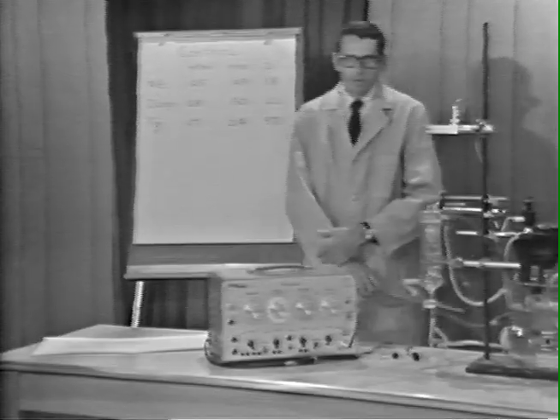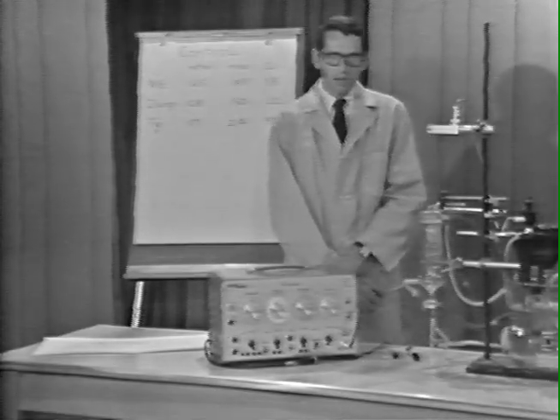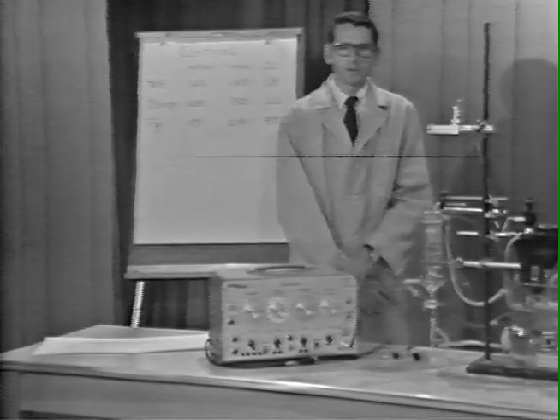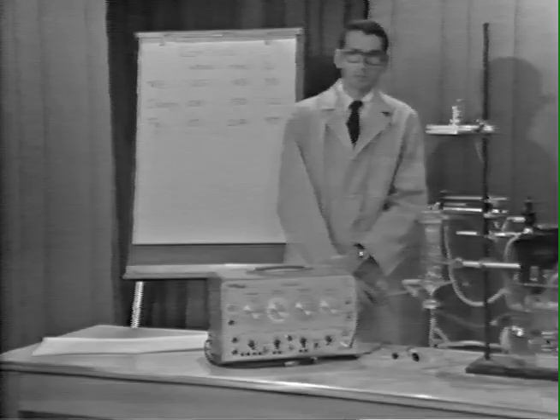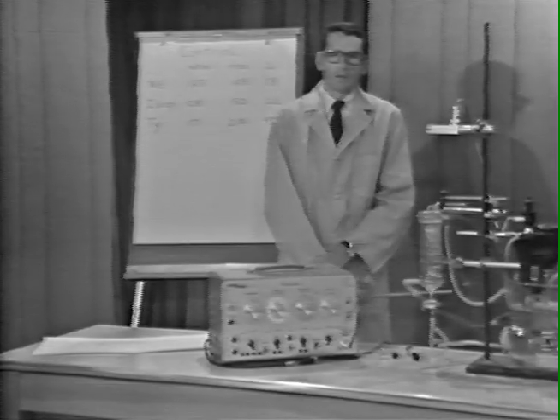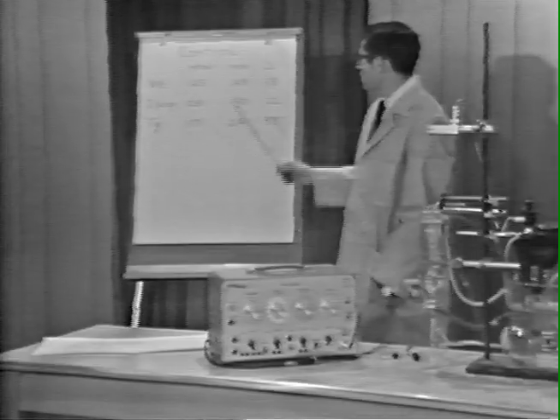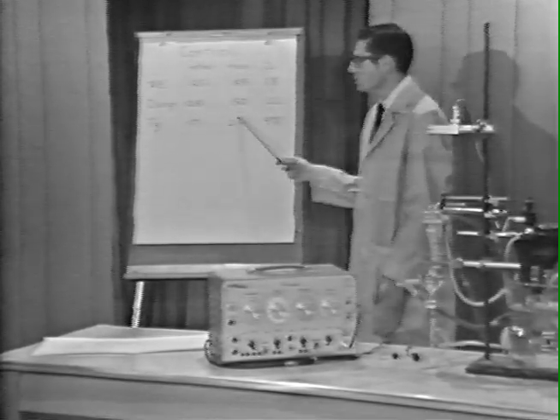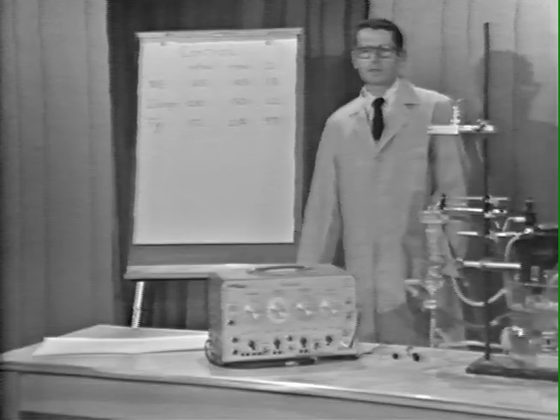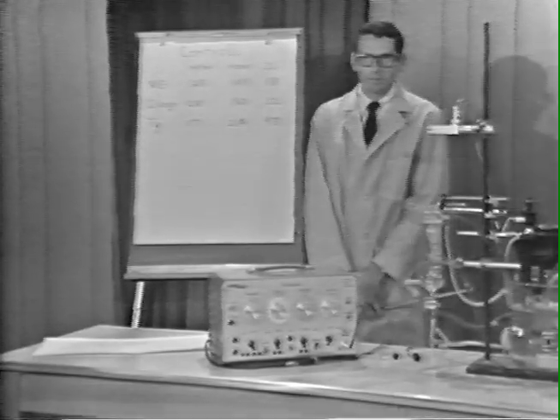Now we are going to put cocaine in the Krebs reservoir so that the atria, again, as in the first part of the demonstration, is exposed to this agent for the remaining portion of the experiment. We will then obtain responses to these same sympathomimetic amines again in the same dosages that we used, and see how this agent, cocaine, modifies these responses.